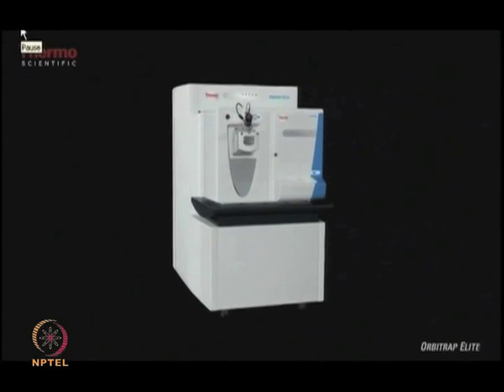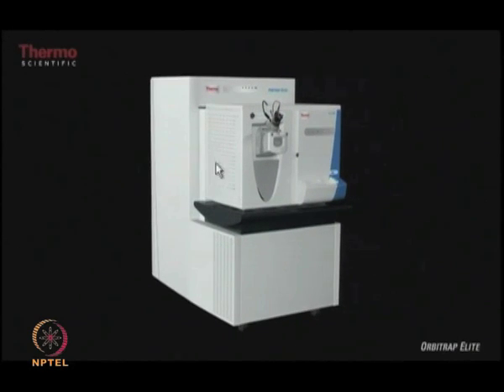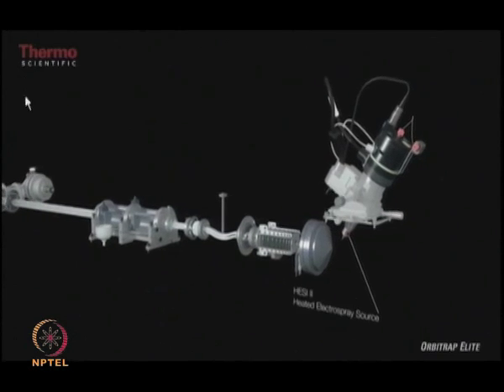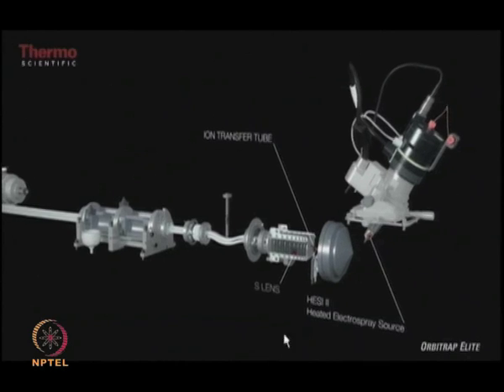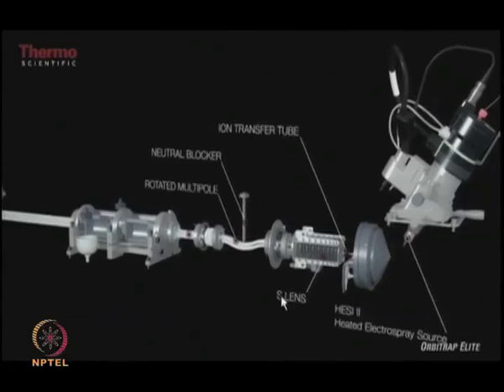The mass spectrometer which is sitting in front is a linear trap, that's an LTQ Orbitrap Velos, and then the back end is the high field Orbitrap, also called the Orbitrap Elite. If you look at the schematic of the system, in the front part is the ionization source. Then you have the transfer optics, and we have the S-lens, which is the newest generation of transfer optics.